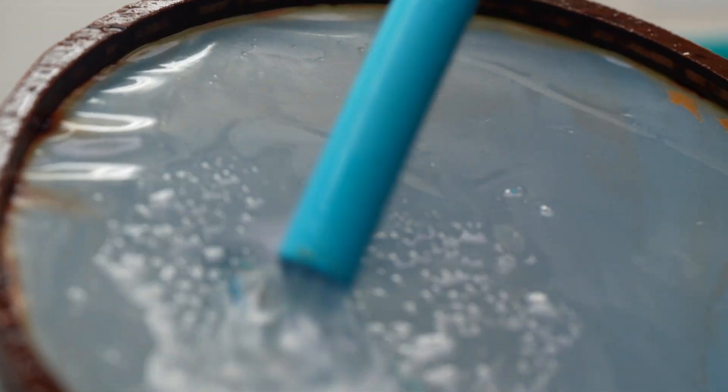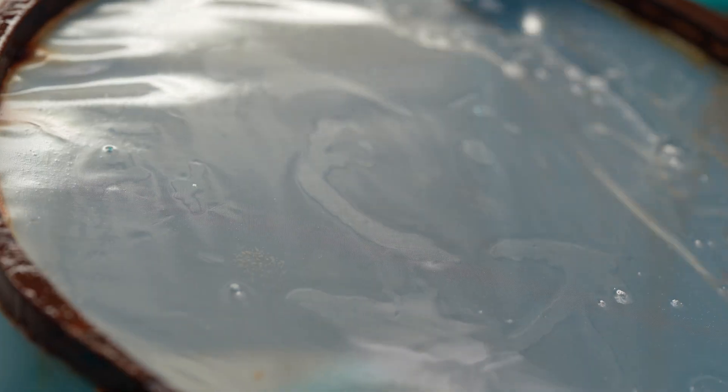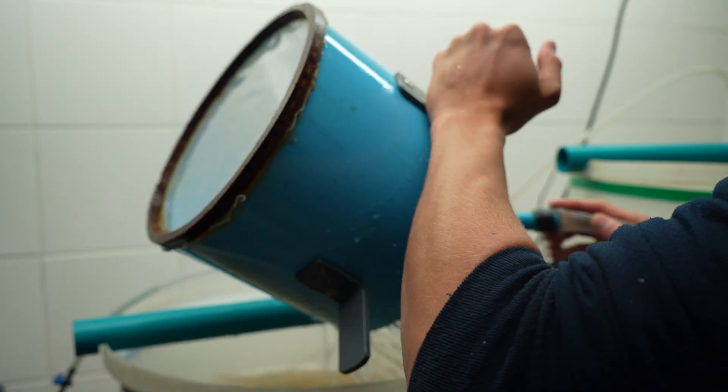So there's still eggs. The capsules have just been removed. So that hard shell has been removed. So now they still need to kind of hatch out into free swimming artemia.